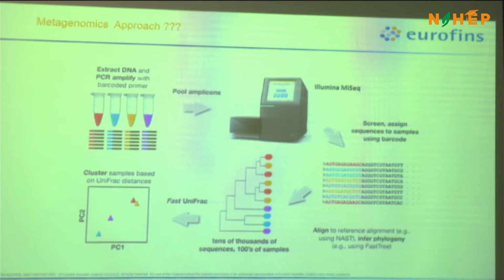In this case, we don't have to do a library preparation. That's the reason 16S or ITS is pretty cheap, pretty low on cost compared to shotgun metagenomics. How we reduce the price is that we prepare the primers with the Illumina adapter sequences, and then we sequence the amplicon itself. In this method we are just adding the indices, which come from Illumina. We can use NEB also. We are just adding their indices.